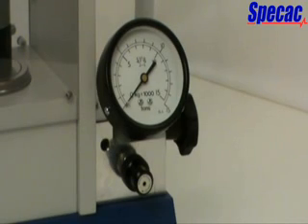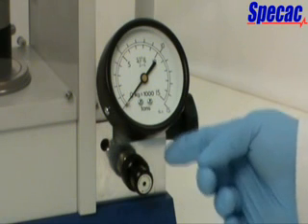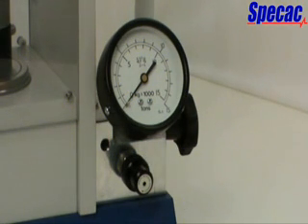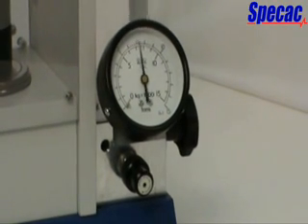Beneath the tonnage load gauge, there is a pressure relief valve, which may be set so that any load between 0 to 15 tonnes is the maximum load that can be obtained. The relief valve screw cap knob can be rotated clockwise to increase the maximum oil pressure in the system and hence the applied tonnage load, or rotated anticlockwise to decrease the pressure and the applied tonnage load. This is a useful feature for pressing applications where a maximum load limit is required; for example, 10 tonnes is the maximum load limit for use of a 13mm evacuable pellet die.